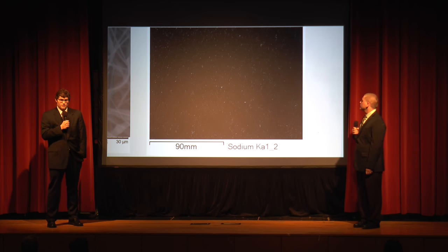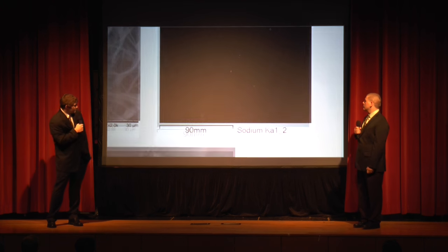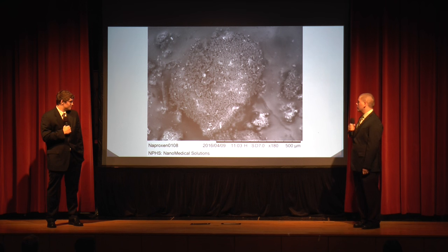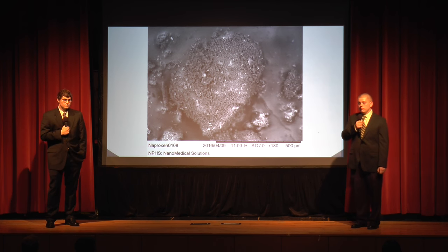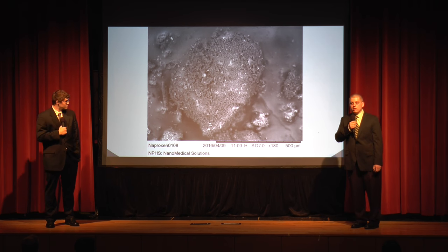This is an elemental analysis of our fibers. The specks you see represent sodium. Because naproxen is the only component we use that contains any sodium, the sodium also represents the naproxen. This is an SEM image of crushed up naproxen sodium. These particles end up within the nanofibers and release into the bloodstream during the fibers' degradation process.